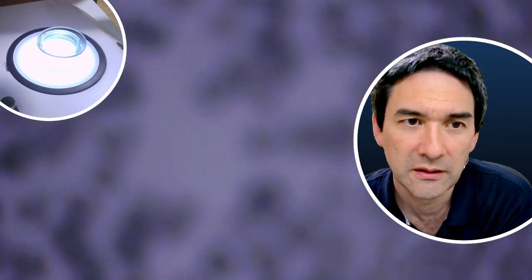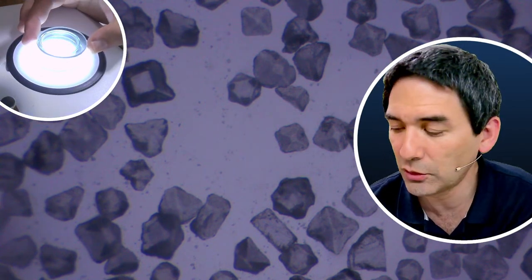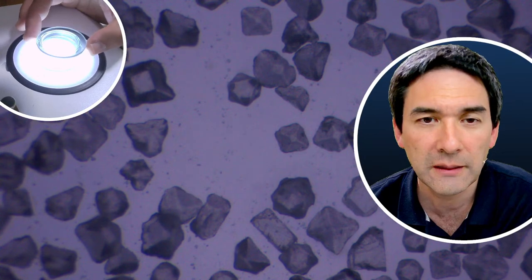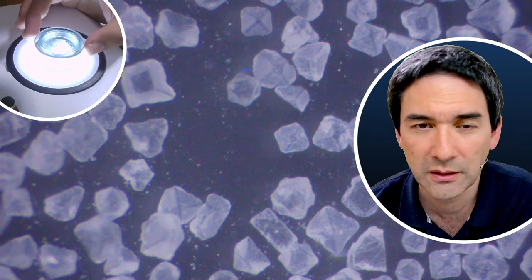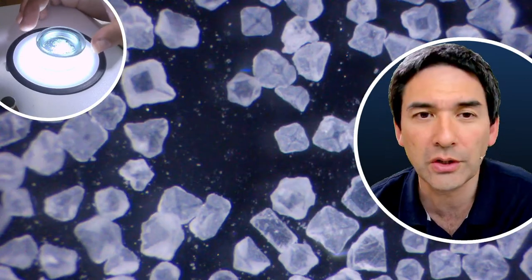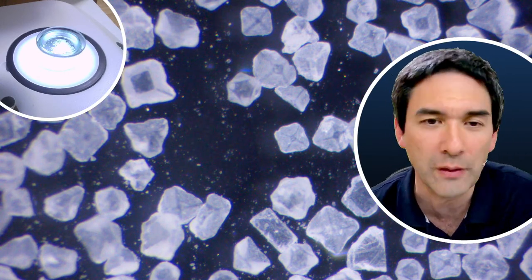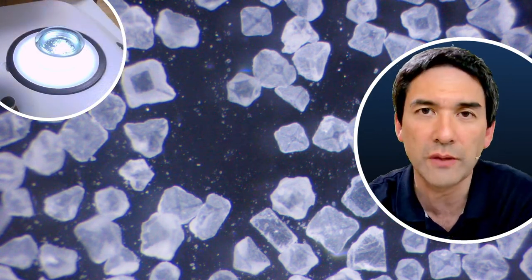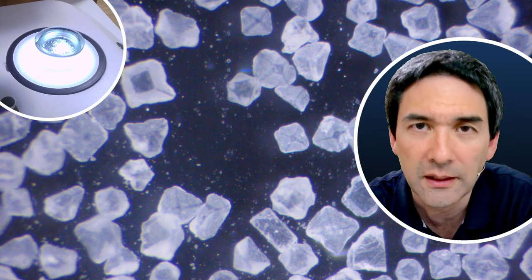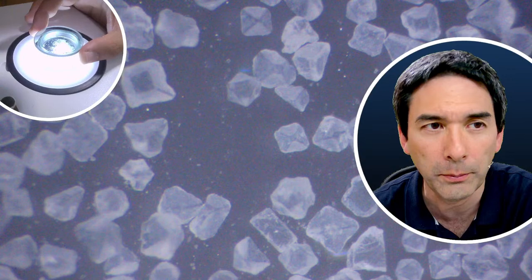Let me focus it first. These are now salt grains. And now it's in focus. And then I turn the top filter until the background becomes dark. The background should become dark like this, and then you have the nicest contrast. This is kind of the idea, because what the salt grains do is they depolarize the light again, and this causes the depolarized light to pass through the top filter.